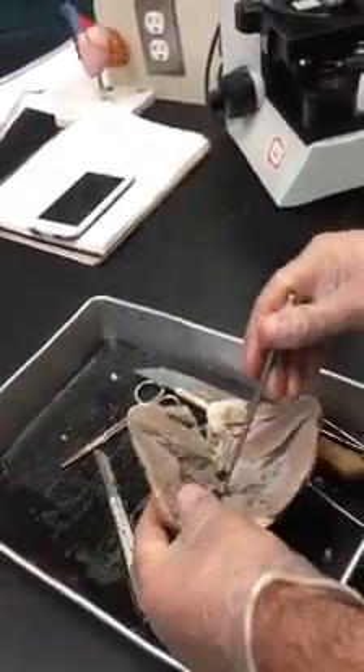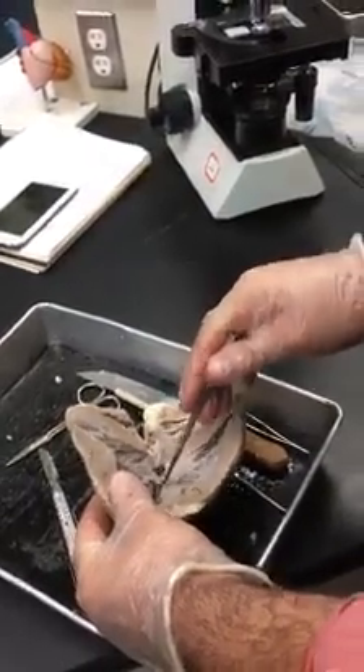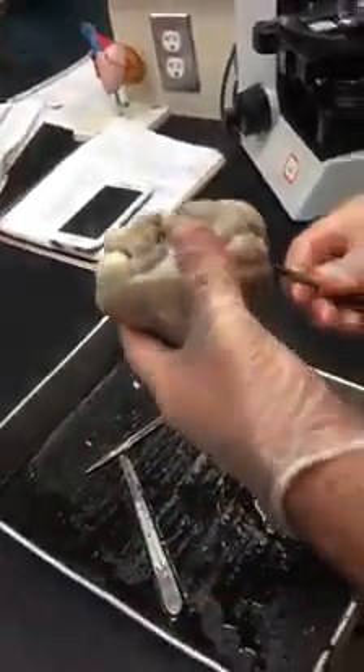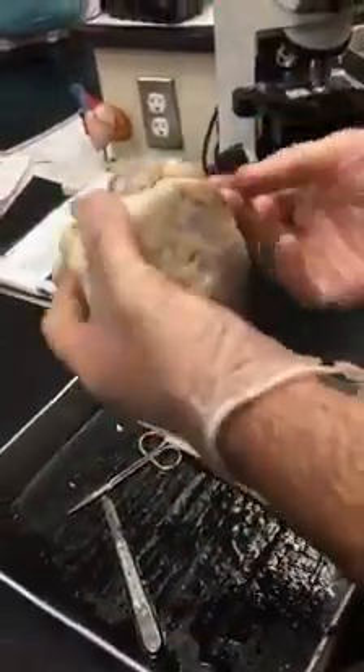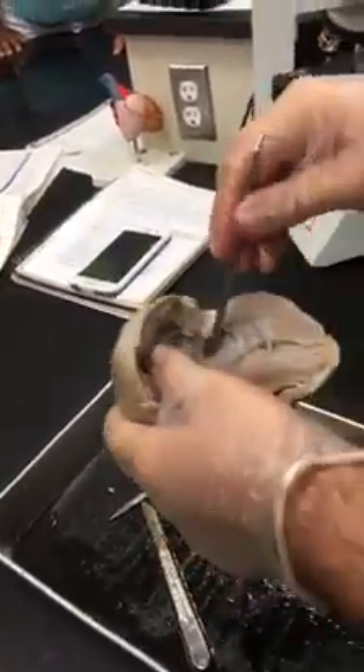These are the flaps of the bicuspid or the mitral valve. Above them would be the left atrium. If I go through the left atrium, I should end up in the pulmonary veins.